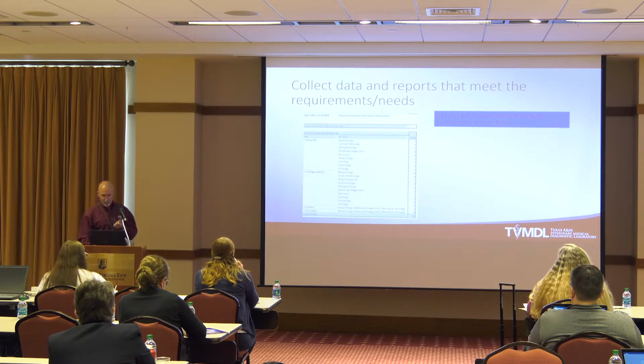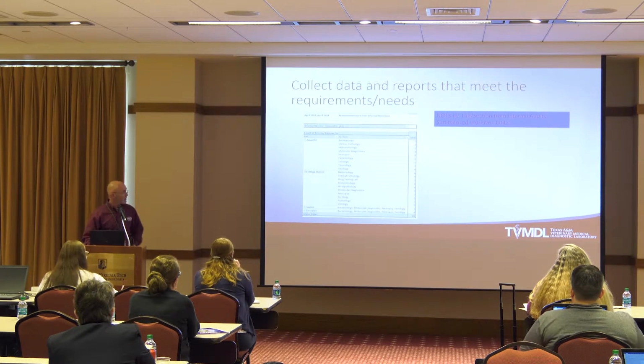This one in particular is the internal audits. So we have a lot of Excel data or data in Qualtrax. We export it, we summarize it, and this is what it looks like. So this is the number of nonconformances for these sections that Casey mentioned before. So we break them down by section so we can kind of zoom into where we may have issues.